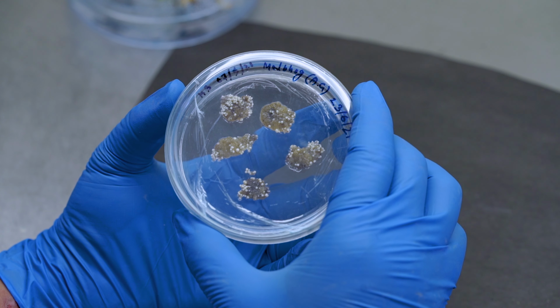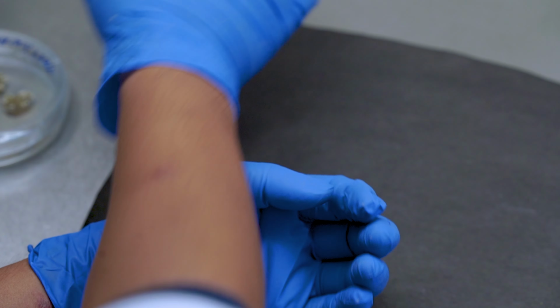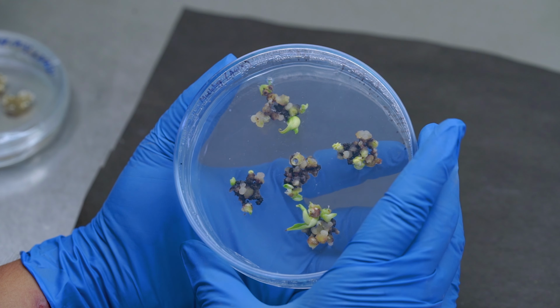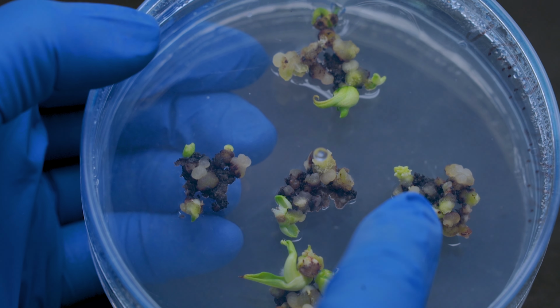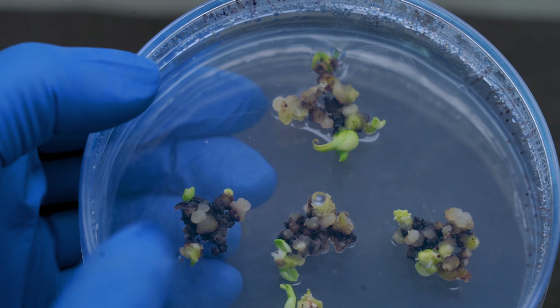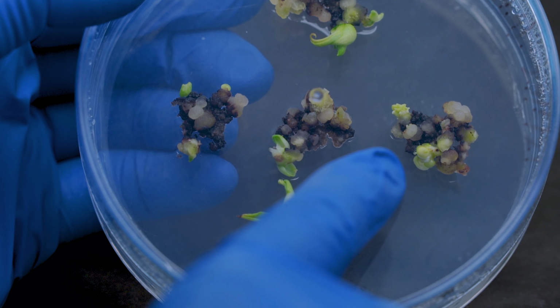And after keeping it in the maturation media for around 2 months and transferring them to the M4 regeneration media, those somatic embryos will start to proliferate and they will shoot out, which we can see over here with the green shoots which are being proliferated on the media.